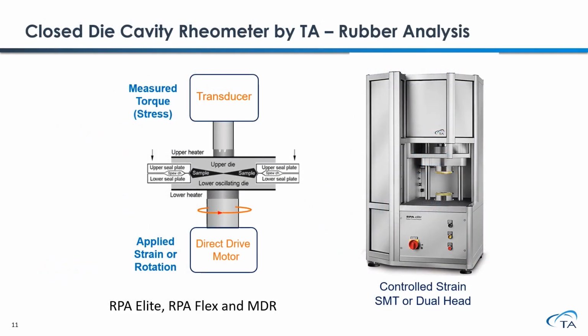In addition to those two models, TA Instruments also provides to our customers a third type of rheometer, which is called RPA. This is a rubber processing rheometer, which is specifically designed and used in the rubber industry to analyze the viscoelastic property of rubber material. Since this rheometer uses a separate software package, we will not be covering the application of these instruments in today's course.